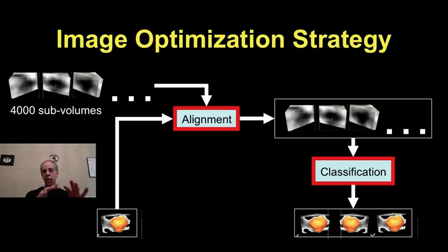So you say, okay, now I have them all aligned. I have them all in a common space. Now I want to group them to try to only put in the same group those envelopes that basically have the same three-dimensional shape. And there are many ways of doing this classification or clustering. But let me just illustrate to you one example. So you have all of them aligned, and now you have the distance that basically led you to the smallest alignment rotation. So you align them, you rotate them, you align them, you have the distance.